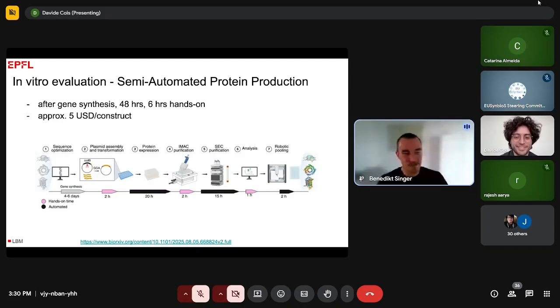And the idea is that after you've designed your sequences, you're quite confident with your designs, you would usually go for something called a 96-well plate, which is decently expensive, but it's not so bad. And the way it's done is that, after the gene synthesis, you go to GenScript or to Twist, and you order your genes, your gene fragments. You would then use Golden Gate assembly to put these into vectors. And from there, it will take around 48 hours to actually get valid results.